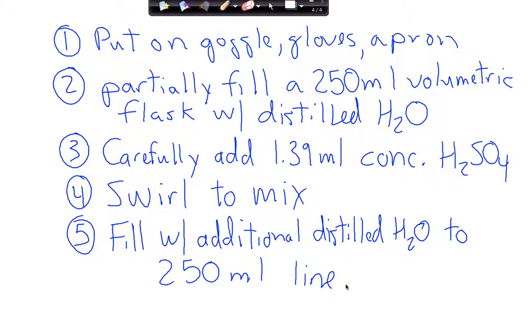Yeah, good question, and the answer is with a graduated pipette. Remember how we have the little droppers, we can even do better than that. We have droppers that are actually graduated down to tenths of milliliters, and then we estimate to hundredths. So we can do it, yeah.